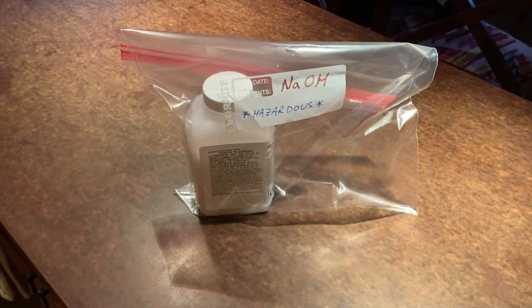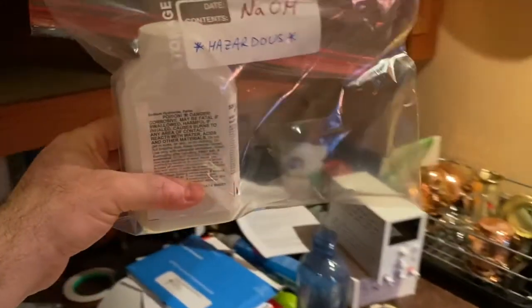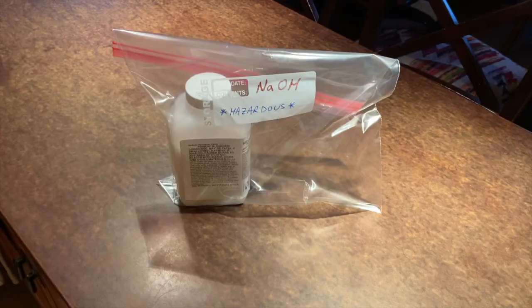In order to avoid any issues, I'm storing the dry alkaline hydroxide in its own secondary containment, off the floor and in a cabinet where my dog, who has a tendency to pull stuff off counters and chew on them, can't get to it. The secondary containment ensures all residuals on the container itself is not going to be left behind in the cabinet when all this is done. Also, alkaline hydroxide is extremely hygroscopic, absorbing enough water from the air to turn into a highly concentrated, dangerous corrosive liquid solution if left out. So the secondary containment also ensures the solid remains dry, even if the inner container lid is left loose.